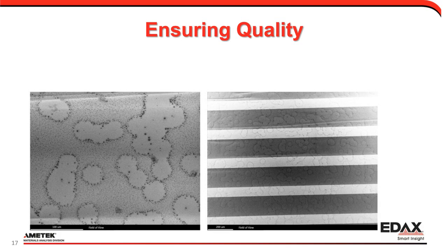This is, in fact, a customer repair unit, EDS detector. So here at EDAX, we strive for the maximum quality to support our customers in their detectors. So when we get a customer repair unit in, our factory and repair guys are taking a look at your detectors with optical microscopy, and even sometimes we use them in the SEM to evaluate what's going on.